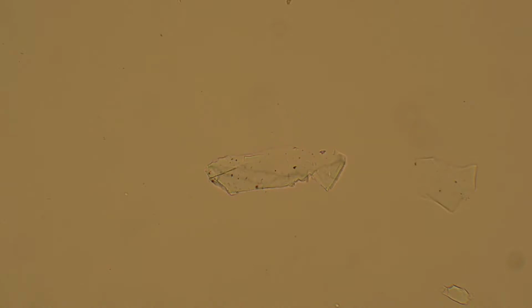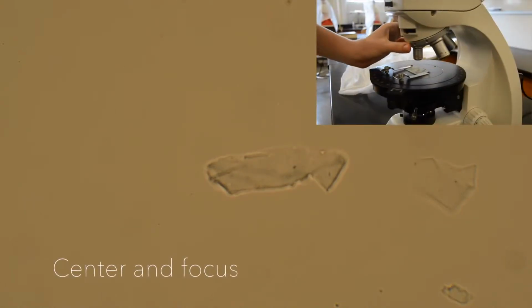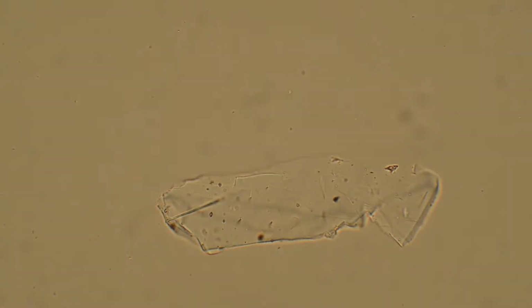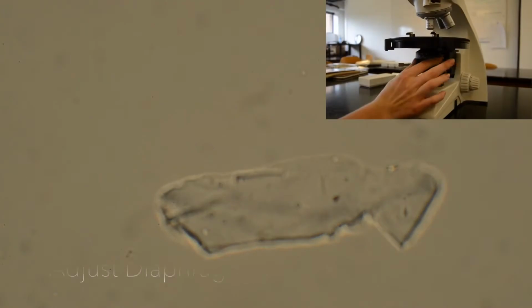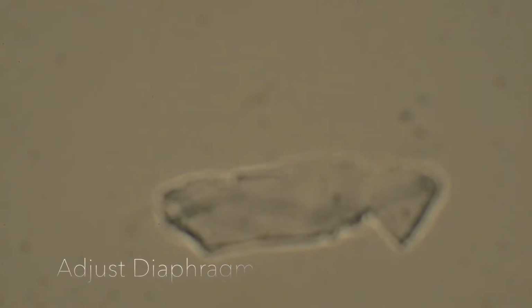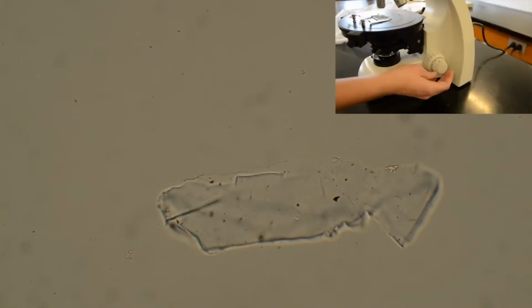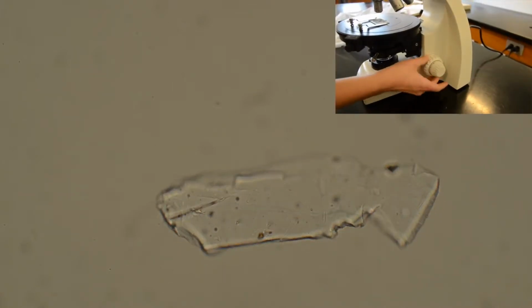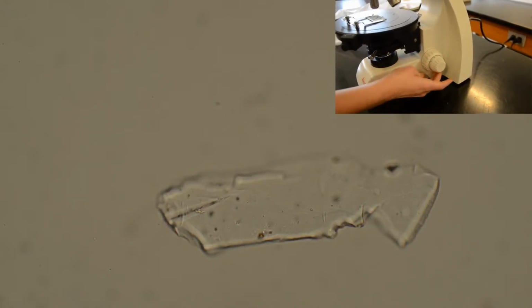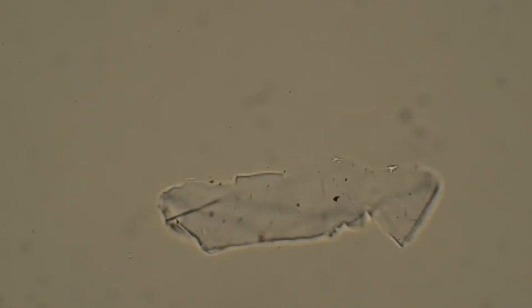Here, we are looking at a grain mounted in epoxy in plane polarized light. In order to determine relief, center and focus the grain. Switch to a higher objective for a larger image, and adjust the diaphragm under the microscope, which will aid in contrast visibility. Notice as we focus in and out, there is a faint white line moving in and out of the grain border. This is known as the Becke line.